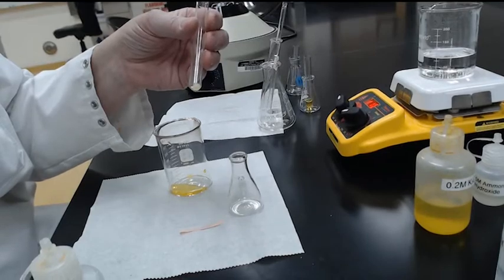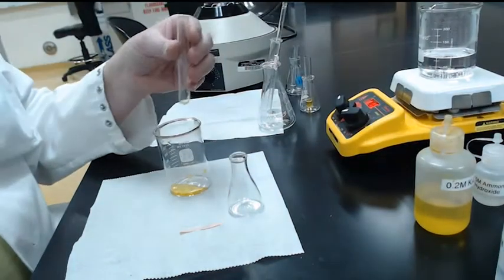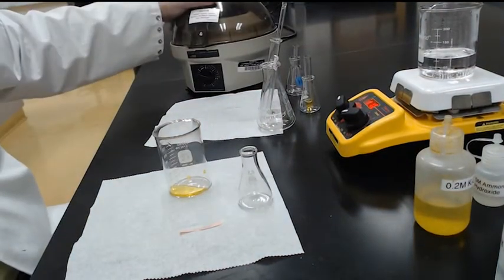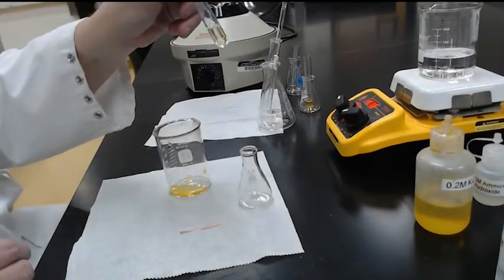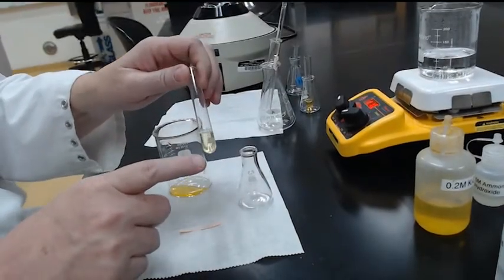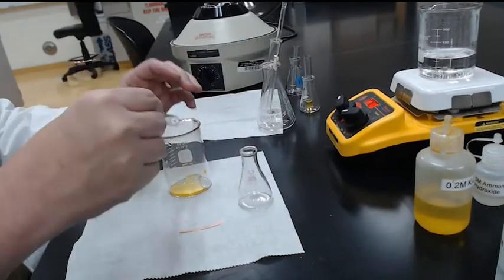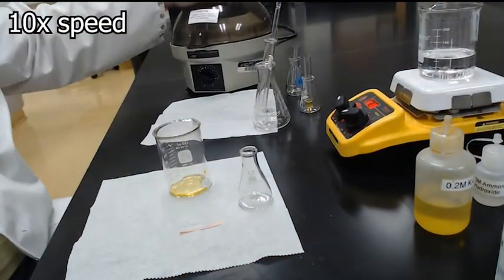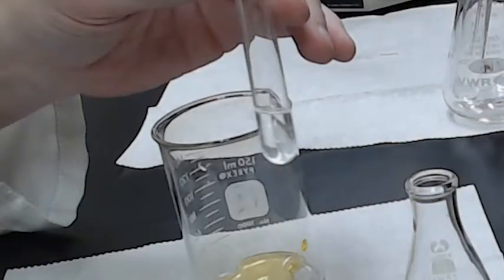So this time it says centrifuge and wash 3 times with water. Washing 3 times with water literally means washing and centrifuging 3 times. And we'll see if we can remove all the yellow liquid from the chromium. Okay, again, the yellow color is fading, which is a good sign. Our precipitate's still nice and white. Discard all of that. Let's do it one more time. Ooh, see how near colorless that liquid is?